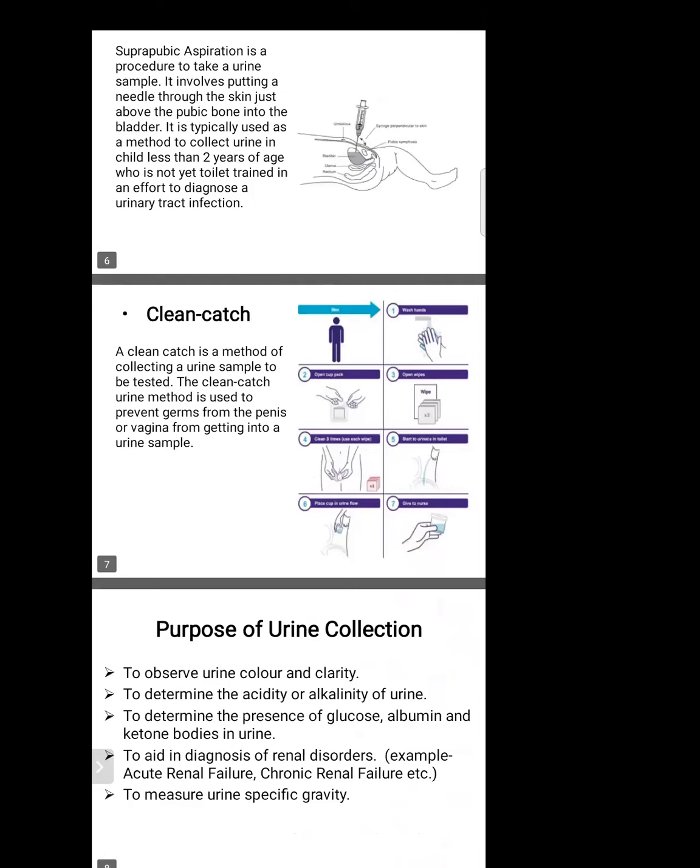And four, clean catch. A clean catch is a method of collecting a urine sample from the patient. The clean catch urine method is used to prevent germs from the penis or vagina from getting into a urine sample.